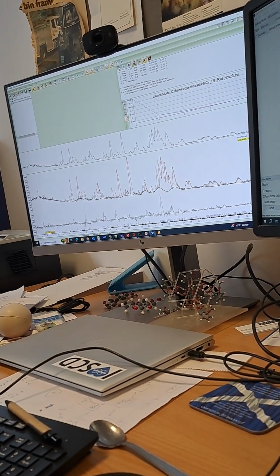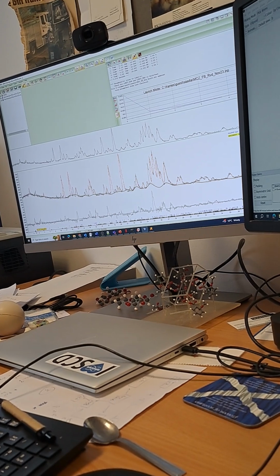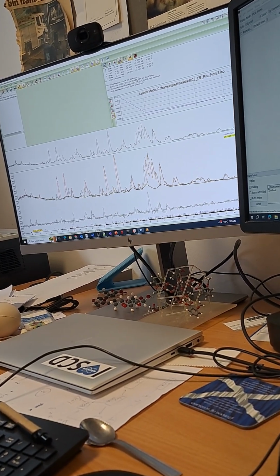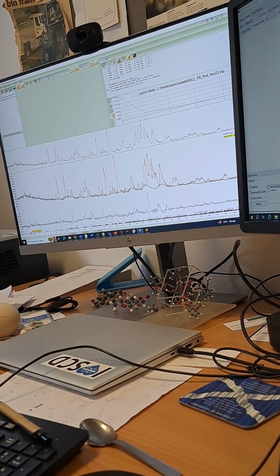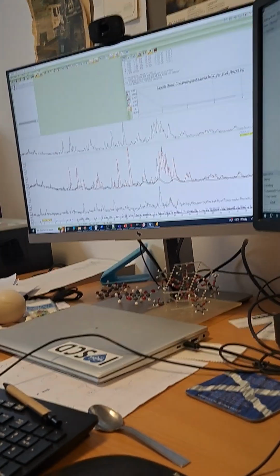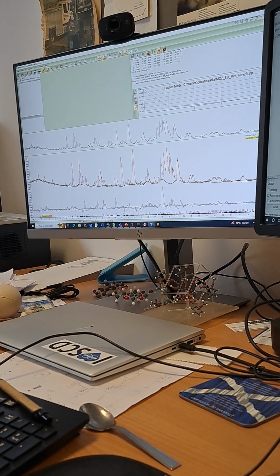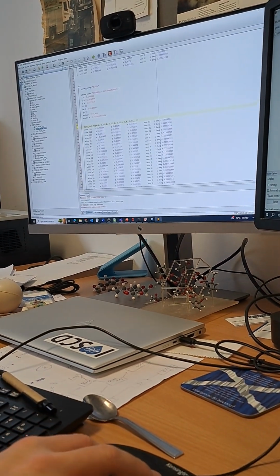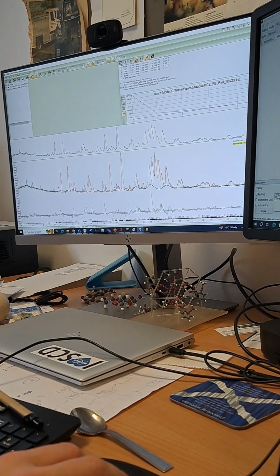Now the good thing about the B-axis in a monoclinic system is that if it says 020 is 16.40, we double that, since it's the second-order reflection. So we're at 32.81 at the moment, but it should be 64.